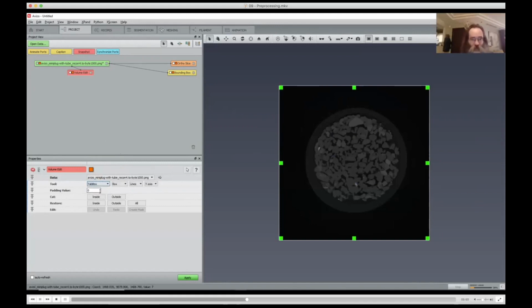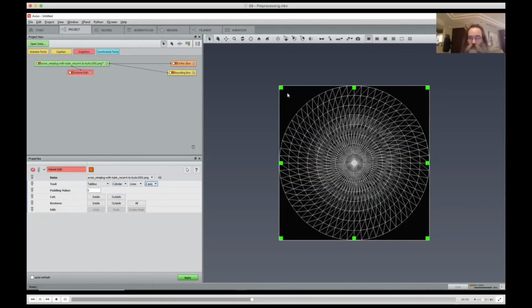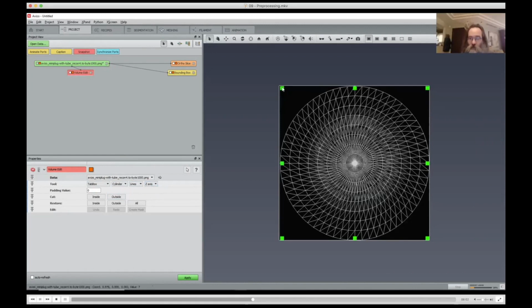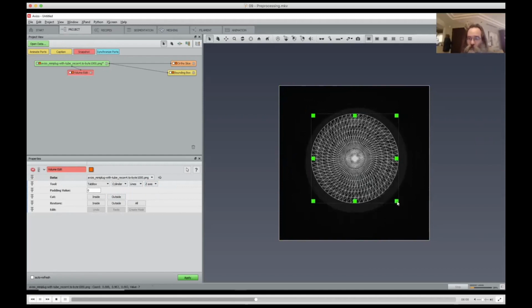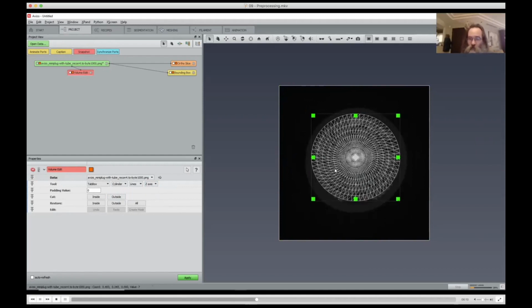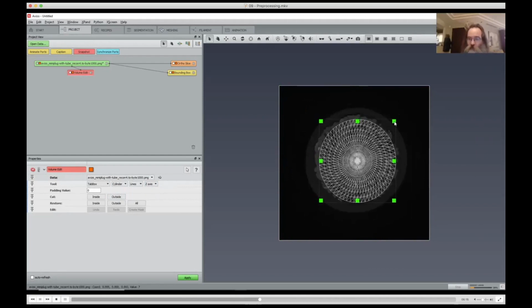But the nice thing in this module is you have different shapes. And you could, for example, use here a cylinder and align it with the z-axis. And then we can just select the rocks now in a cylindric shape. So from top, it looks like a circle. Maybe that's too much. Let's be a bit conservative, move inside like this.